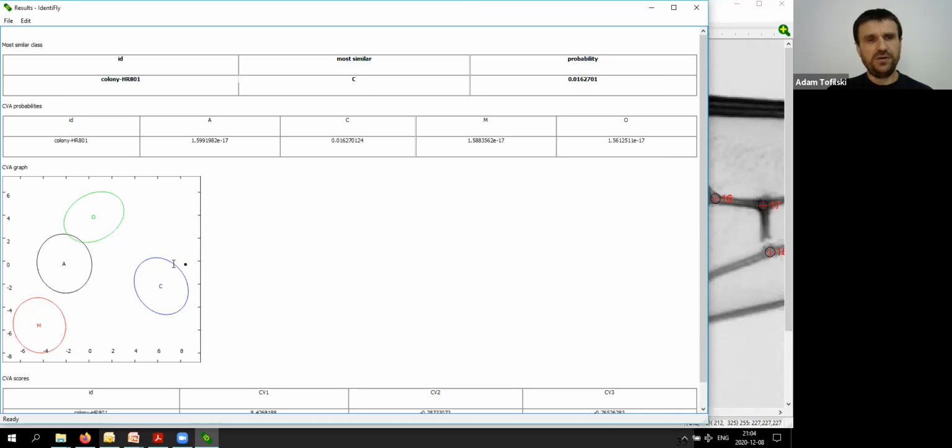And you can see on the graph that the black point is a little bit outside of the ellipse for lineage C. But you also need to realize that this reference sample, about which I will talk soon, was based on bees mainly from Austria, and only a few colonies were from former Yugoslavia and Croatia.